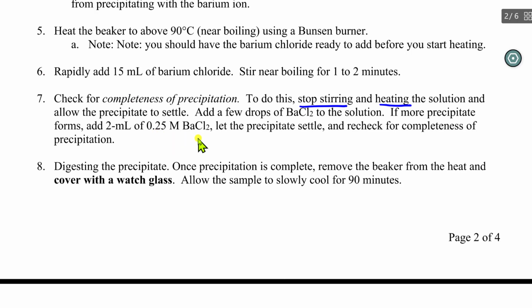One of the things students have trouble with is that when you add two liquids of differing densities together, you'll see waviness in the solution. That's not the formation of more precipitate. That's just from the different indexes of refraction of the solutions because of their temperatures and compositions. So don't worry about waviness, but make sure it's not cloudy.